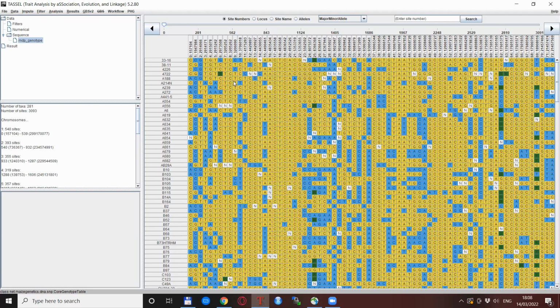You see different letters here with different coloring. The coloring we will explain a bit later, but first what the letters mean. If you go with the slider down, this consists of 10 chromosomes, but if you go down here, these are the nucleotide coding. The A is homozygous AA, the C is homozygous CC, and so on. The R is the heterozygous AG, Y is a heterozygous CT, and so on. The N is unknown. And there are also options for deletions and insertions, as well as other heterozygous combinations. So this is what these letters mean.